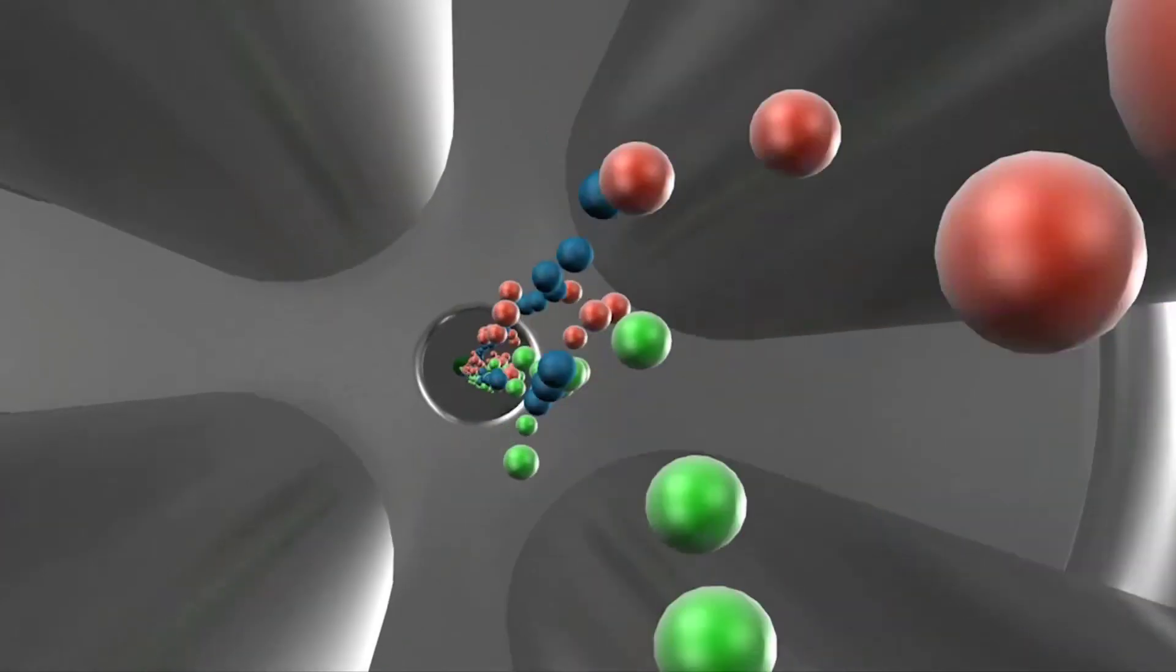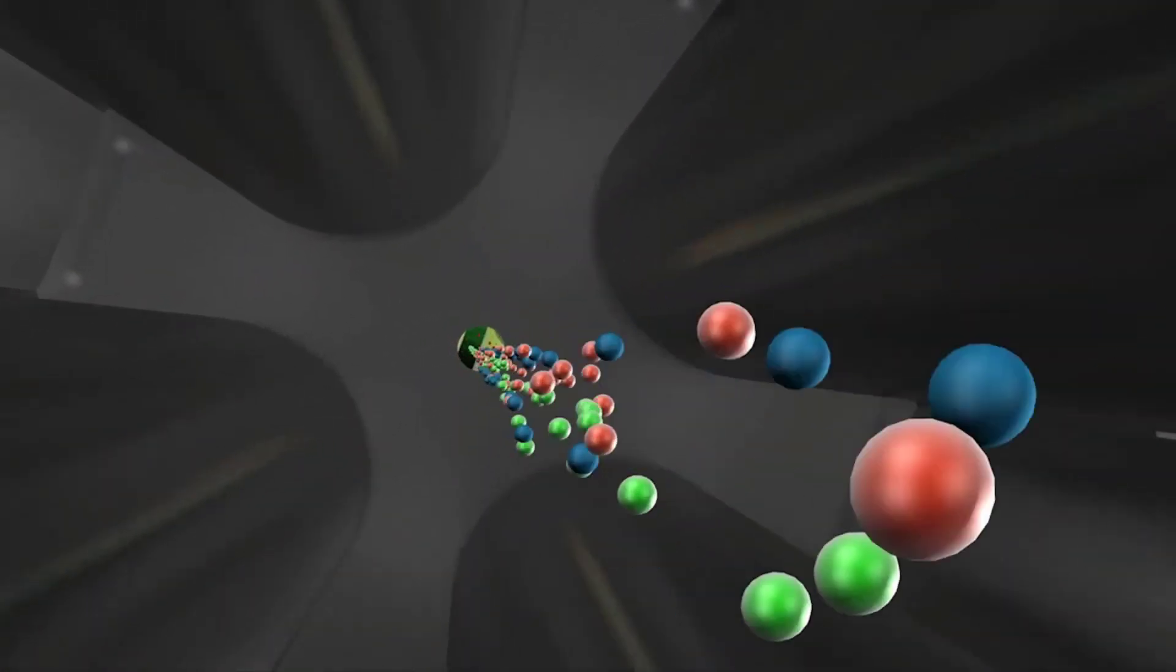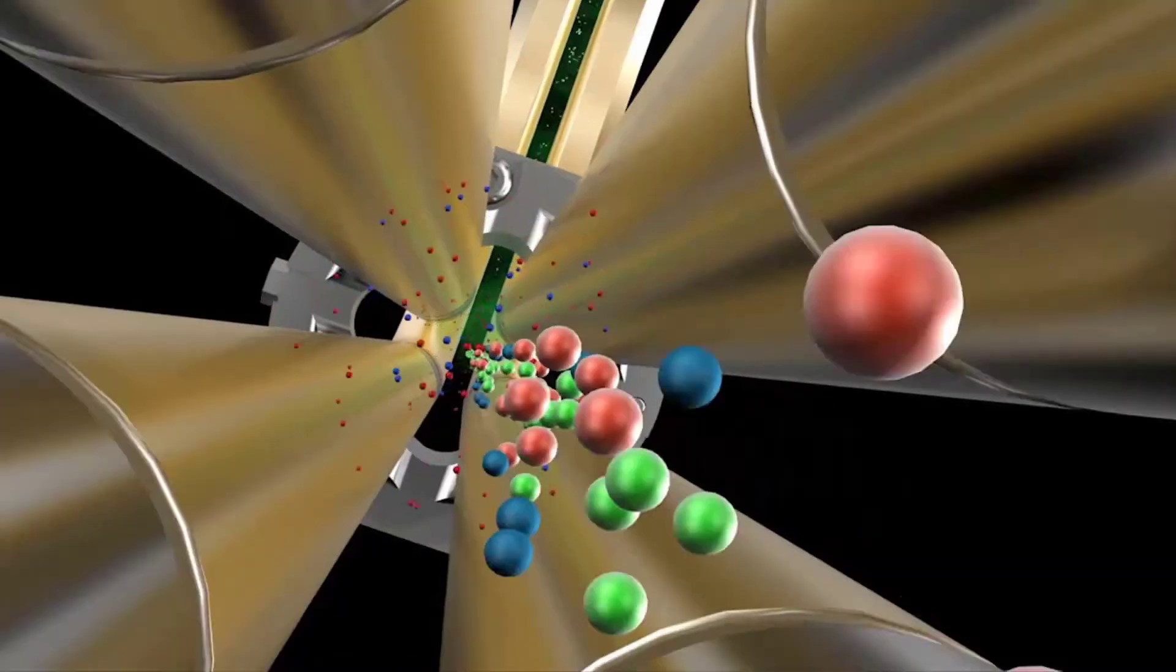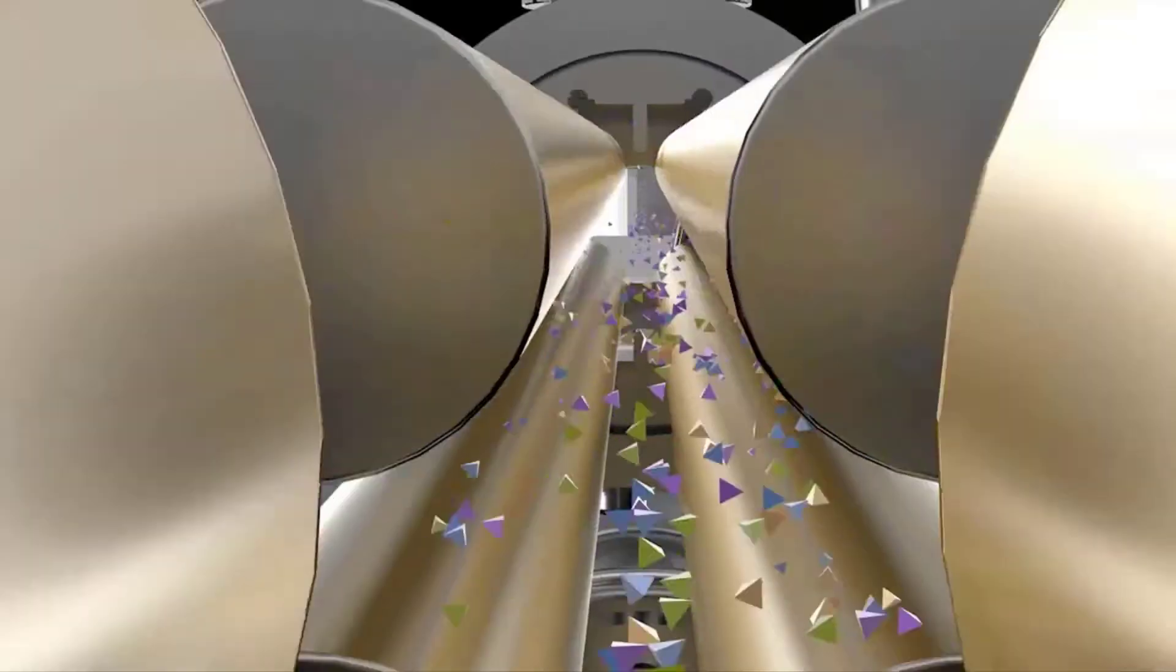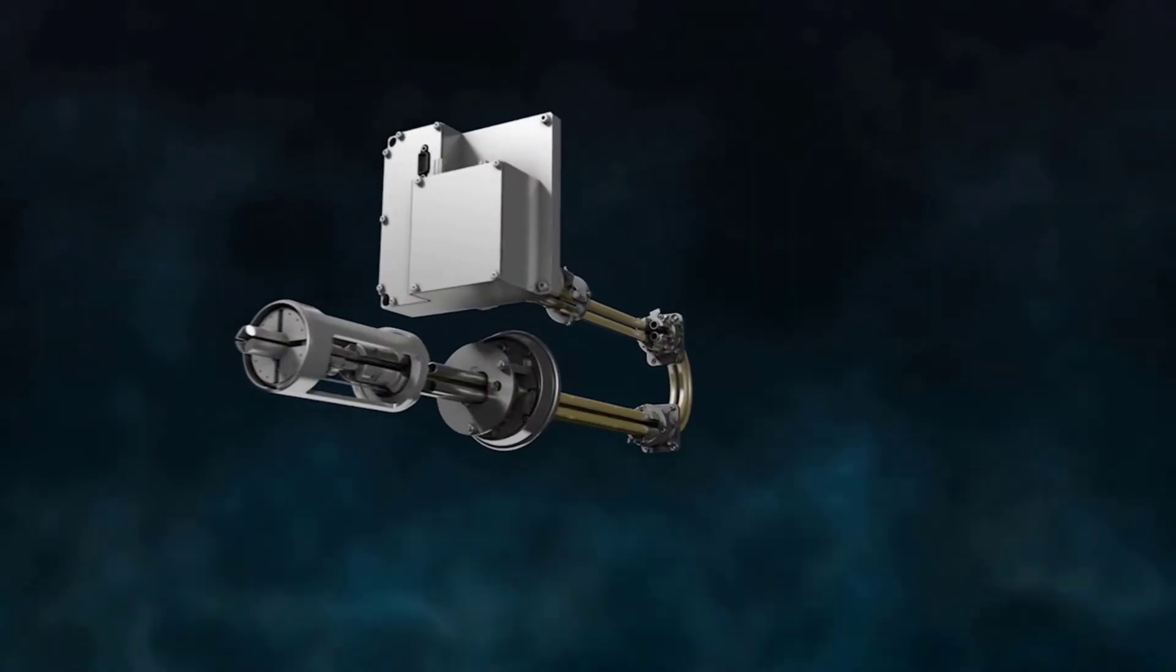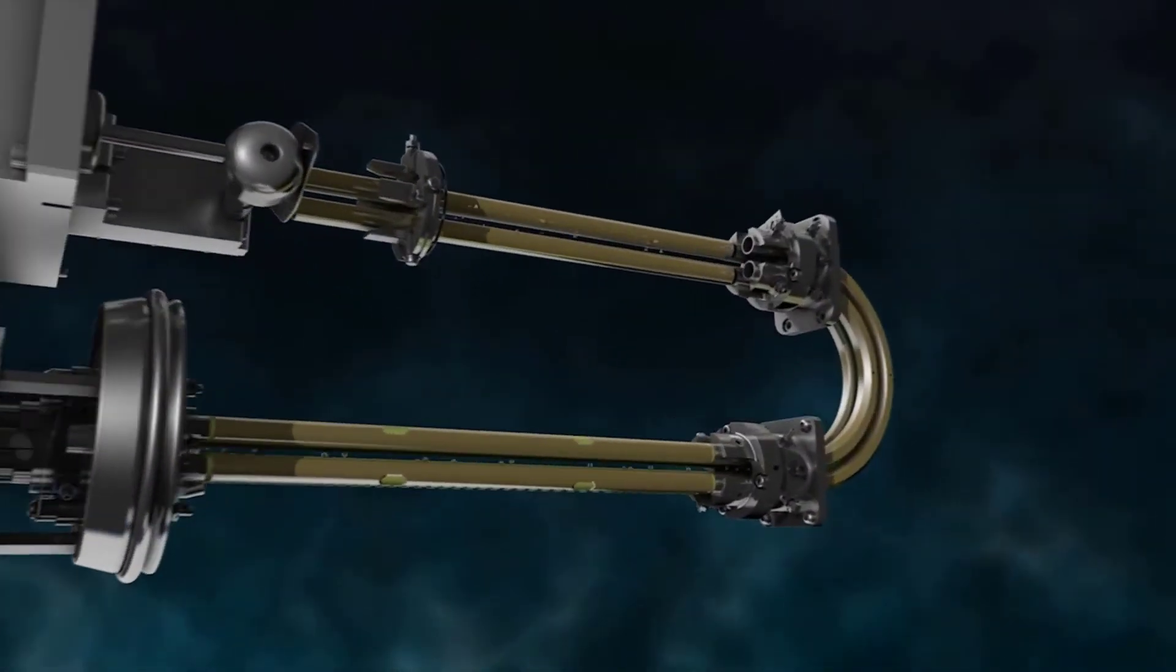Mass analyzers can filter, select, fragment, and most importantly measure ions of different M over Z. There are different types of analyzers, but they typically use electric or magnetic fields to separate and focus ions of different M over Z. A popular example is the triple quadrupole that uses alternating RF and DC voltages to separate ions.